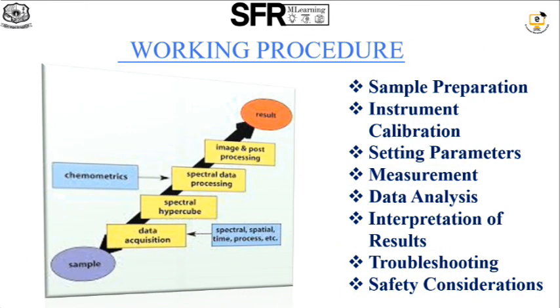Next, the working procedure of spectroscopy. First, we collect and prepare the sample for analysis. Second, choose a radiation source. The radiation interacts with the sample, and we measure the absorbed, emitted or scattered radiation. Then we generate the spectrum to analyze and identify the sample characteristics, which are the composition, structure and properties. Last, we draw conclusions from the results.